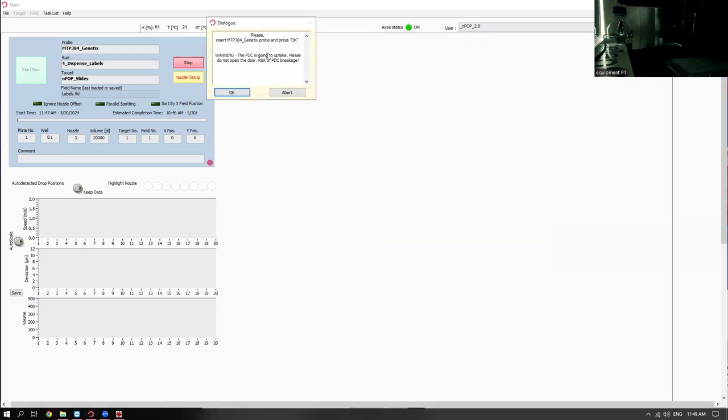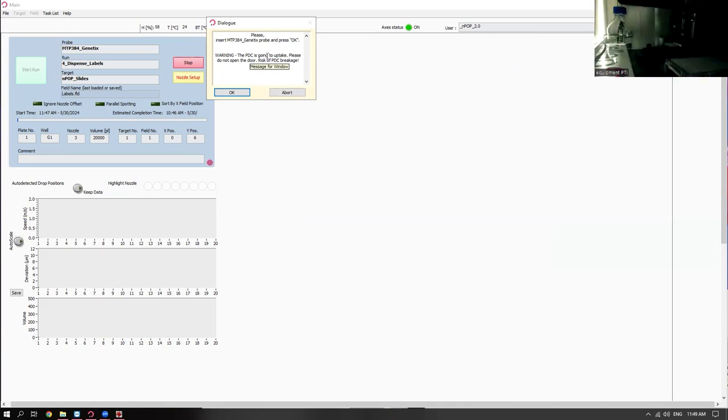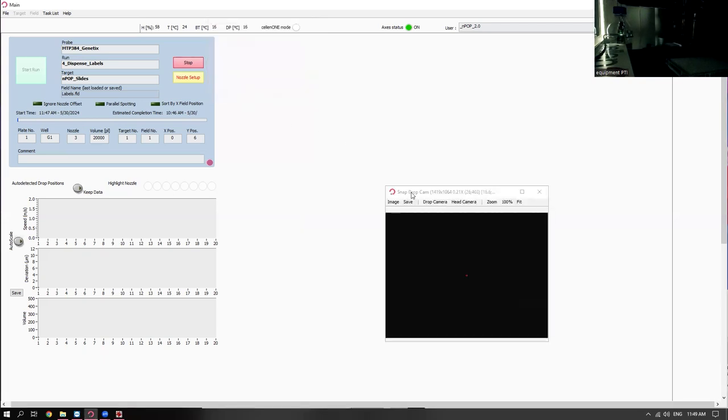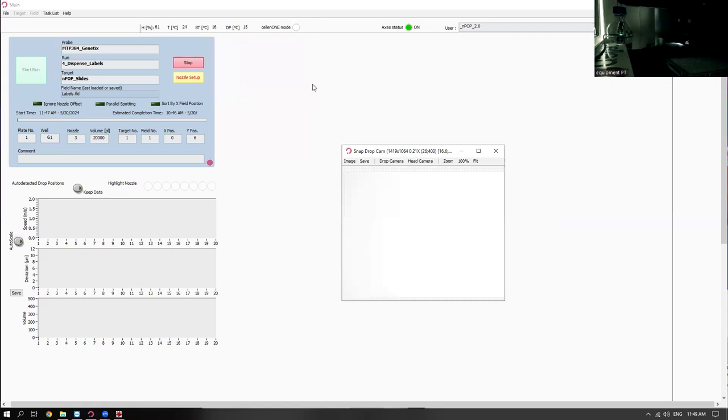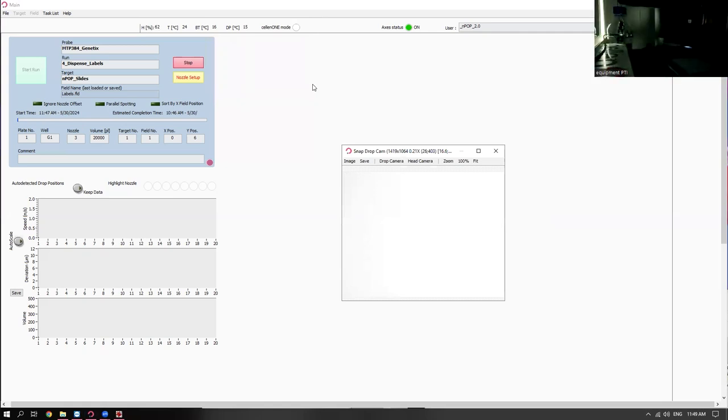So it says, make sure that the plate is in there. It's your last chance to make sure that there's no seal on it, that it's in the appropriate location. You indexed in the front left, right? Yes, the A1 is the... And you taught the plate to the front left? Yeah. Okay. So it's going to go and scan everything.